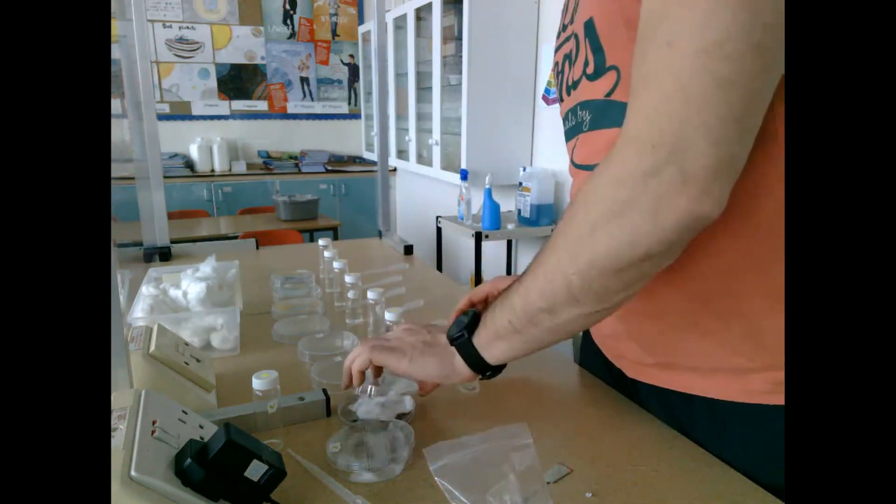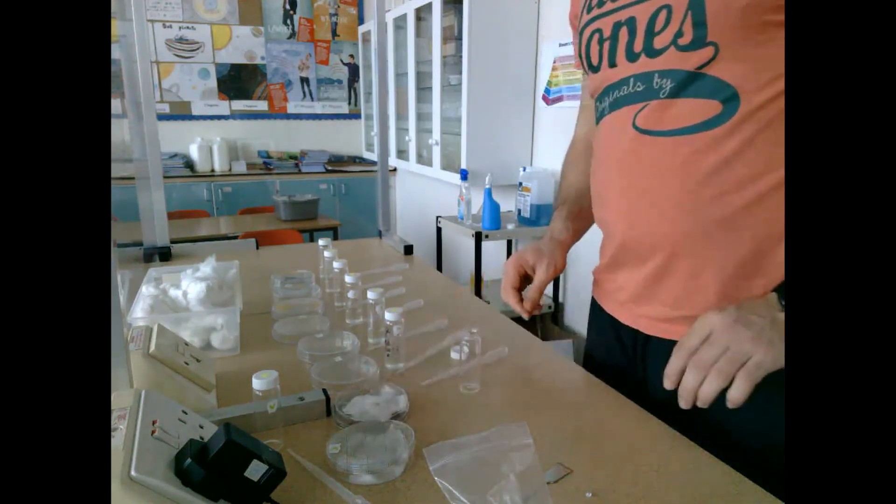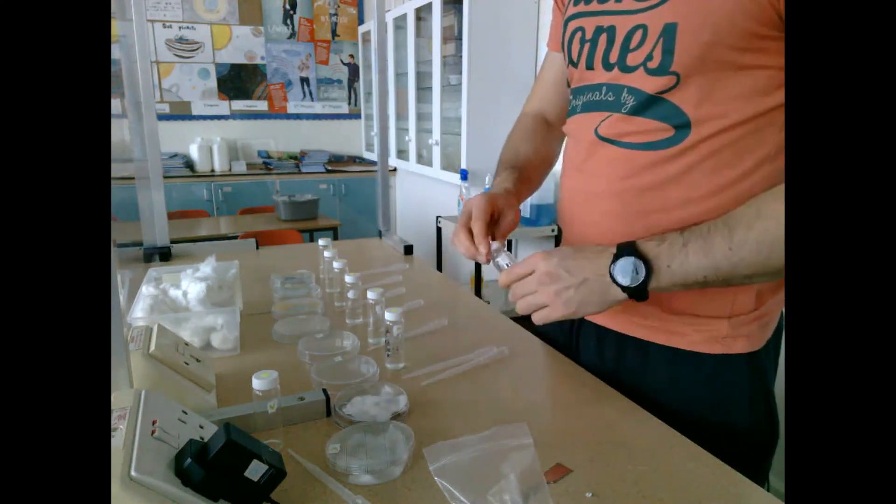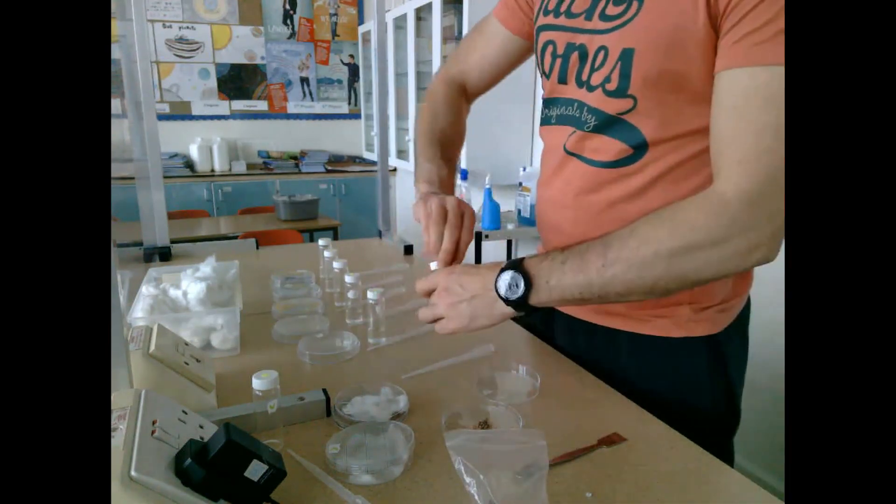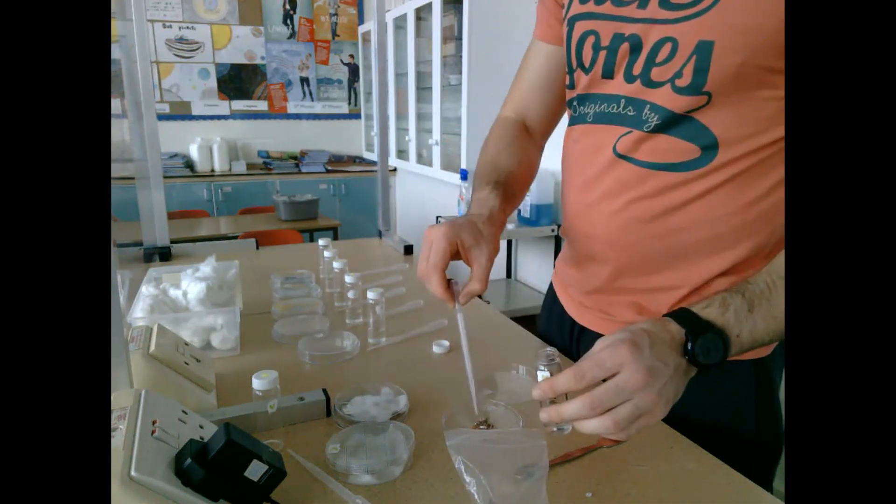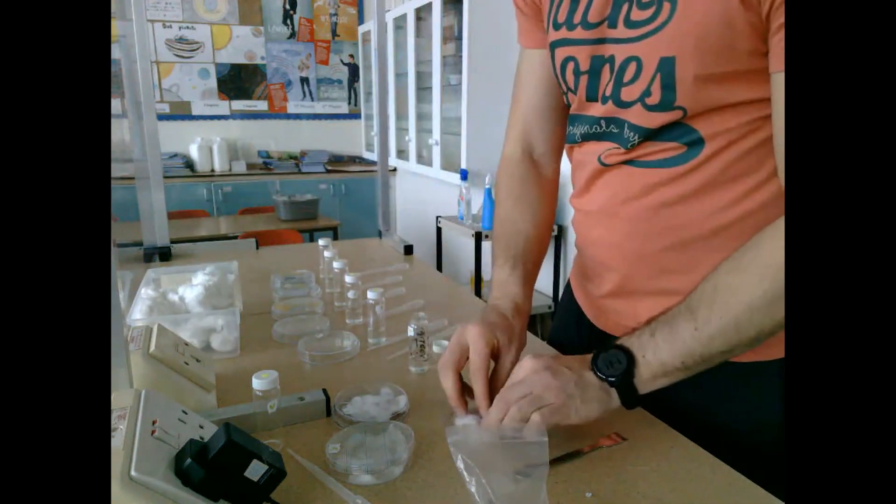I'm going to continue doing this for glass jars two, three, four, five, six, seven, and eight until every single petri dish has their radish seeds and their entire solution present on the cotton wool.